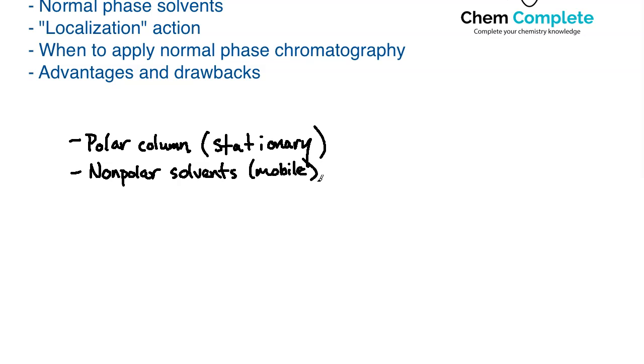And these are going to be relatively nonpolar, whereas in reverse phase, which is the more common technique utilized today and more prevalent in the literature, primarily polar solvents were used, with water topping that list. Water, generally speaking, is a big no-no in normal phase HPLC, especially if you're dealing with something like a bare silica column, because then if you don't have those modifications, the water can almost act as a modification. And we'll talk about that in the pros and cons section.